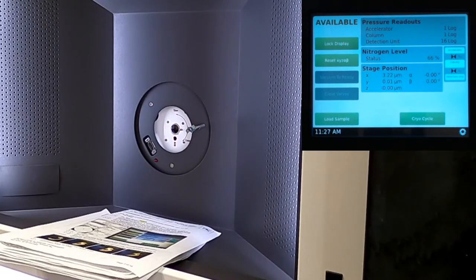Okay, so next you will need to load your sample. Because today we didn't set up a camera over here, I will just load your sample. And remember, you will need the second training. Probably we can talk about that in your second training. So I'll just load the sample on the single tilt holder.